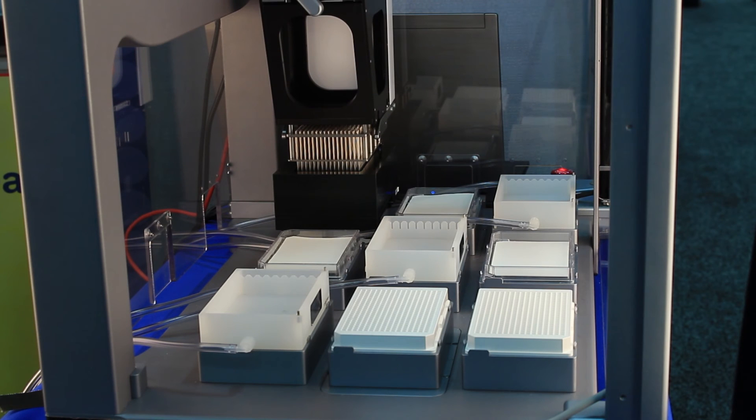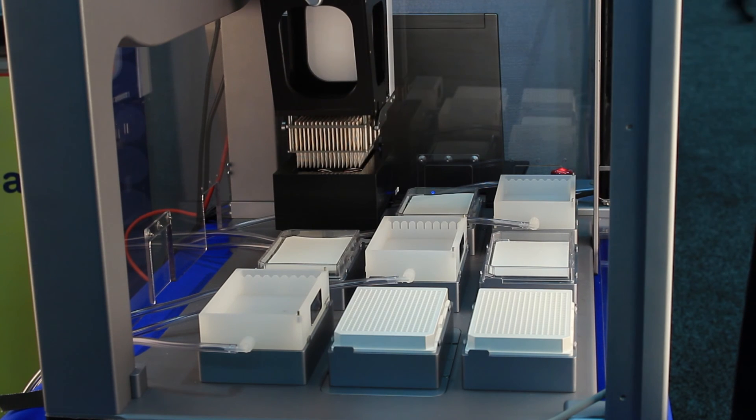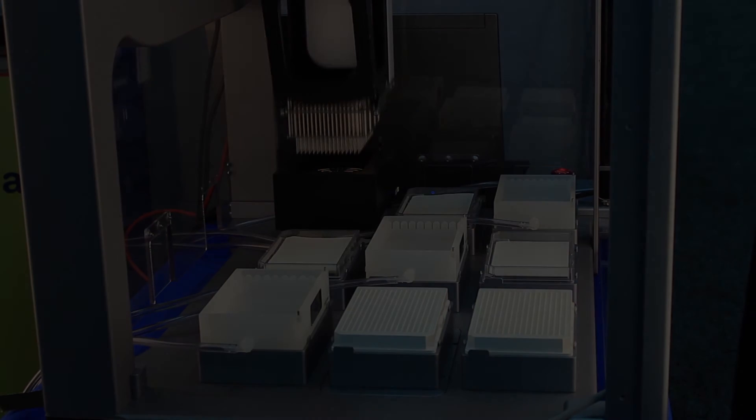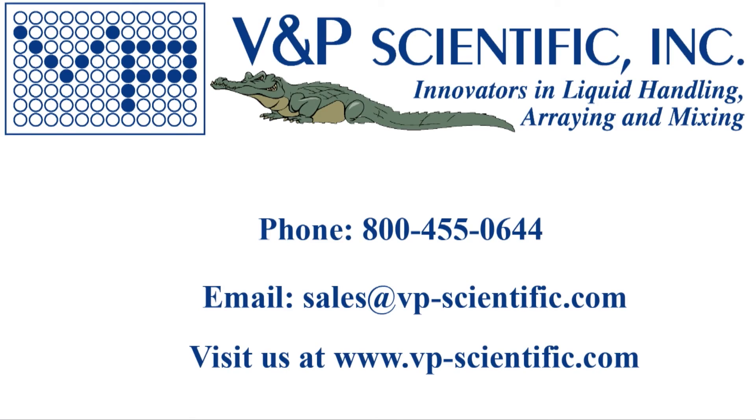Lastly, the pins are placed over a pin tool dryer, which dries the pins. Contact us for more information on the products you have seen in this video.